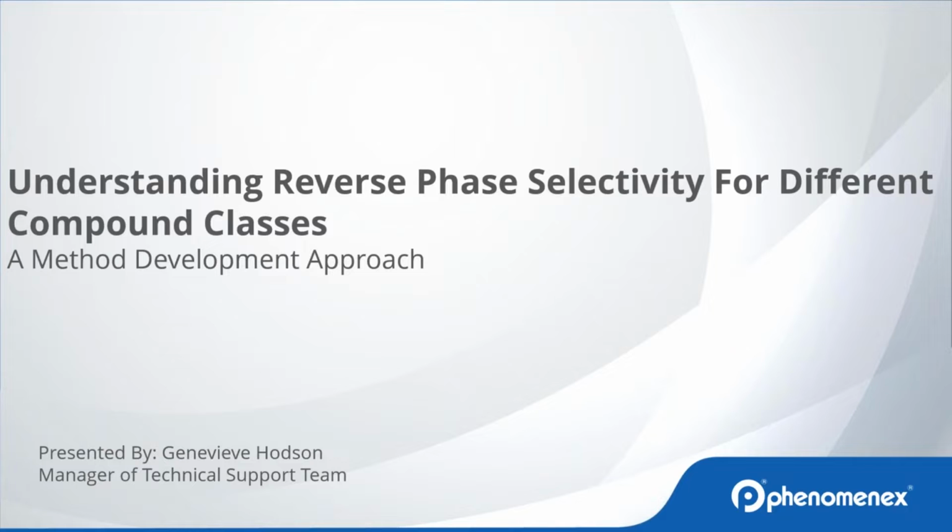Today, we will be going over understanding reverse phase selectivity for different compound classes. This is a method development approach. I'll give you guys a little bit of background while a few additional people come on in.